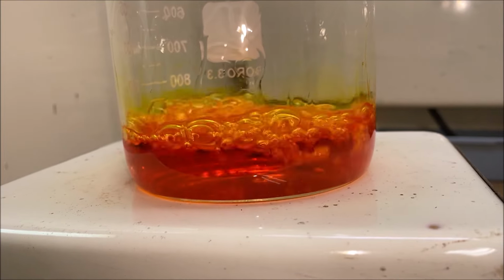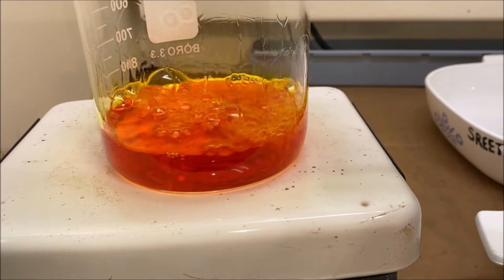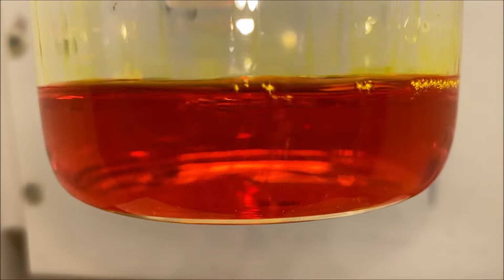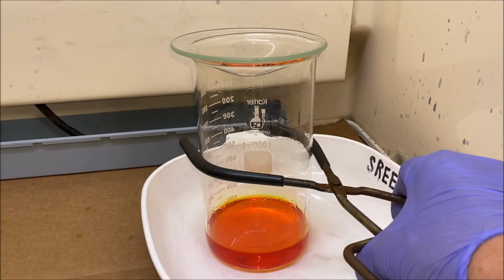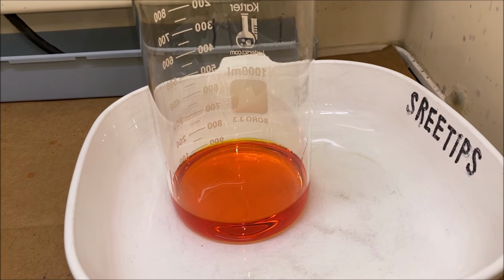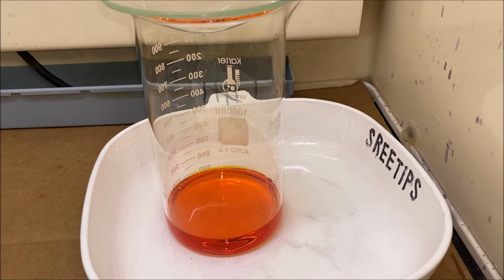This is perfect. We've got all of the gold dissolved in minimal nitric acid in aqua regia. So what we'll do is we'll set this back here. Look at that beautiful crystal clear orange gold chloride solution. Let's set this back here and let it cool off naturally. So now we've got 25 grams of pure gold dissolved in this liquid, and we can adjust the liquid level with water to get the proper concentration for the electrolytic gold cell.